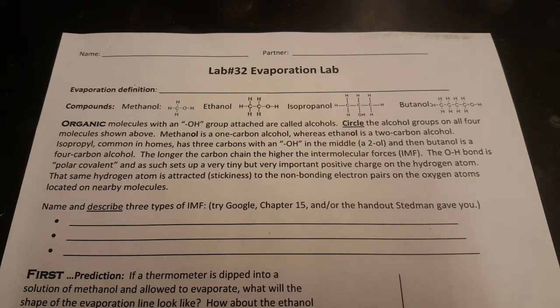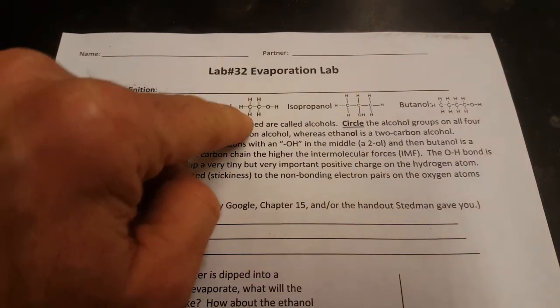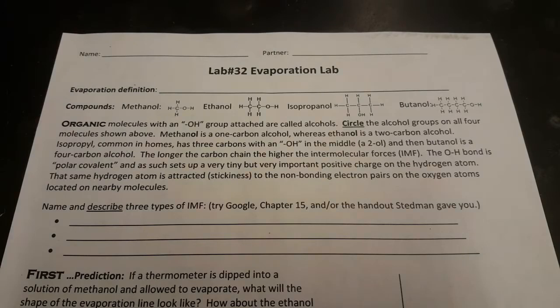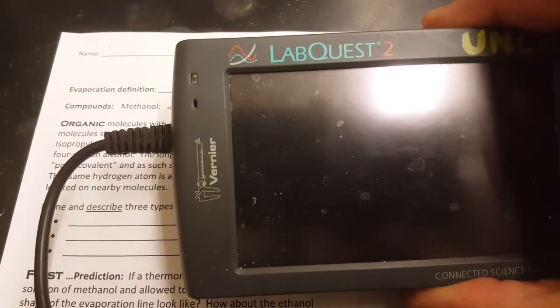Welcome to the evaporation lab. In this lab, you're going to take methanol, ethanol, isopropanol, and butanol. You're going to compare their evaporation rates by how quickly they change and how extremely they change temperature. Because of that, you're going to be using a LabQuest today with a thermoprobe.